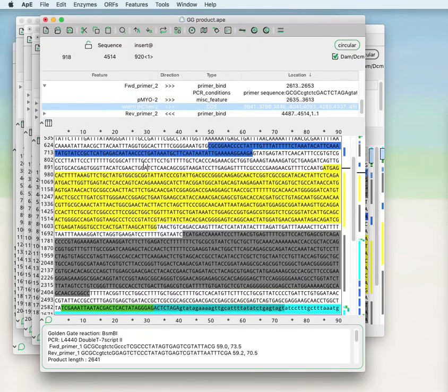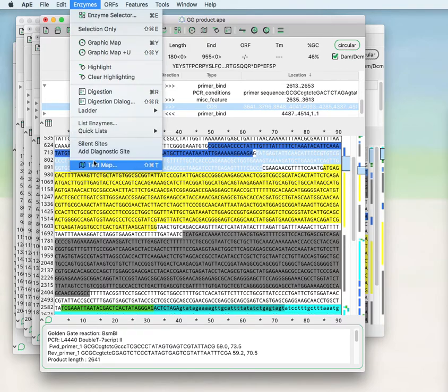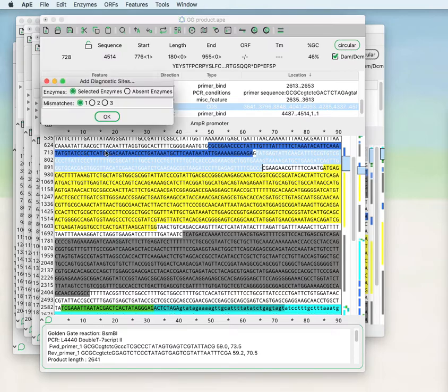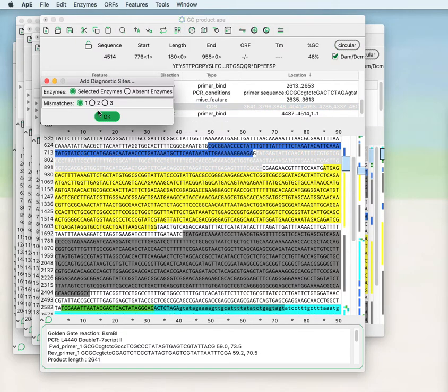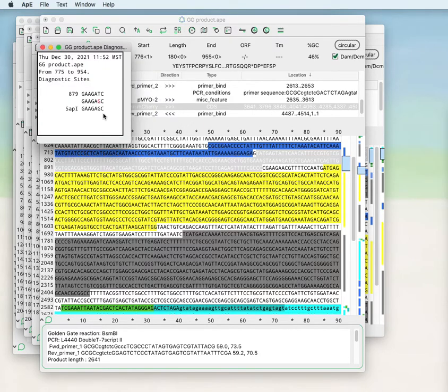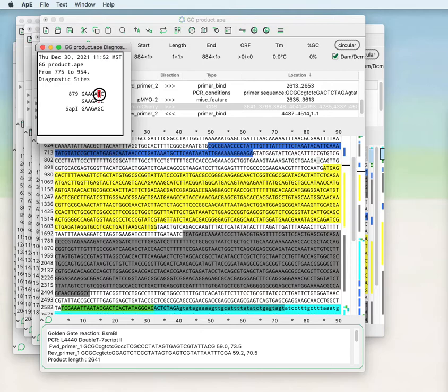If the region that I'm mutating is not an open reading frame, you can use the diagnostic site tool which will search for potential restriction sites and minimize the number of mismatched bases within the search. In this case, you can introduce a Sap1 restriction site by mutating this T to a G within the selected region.